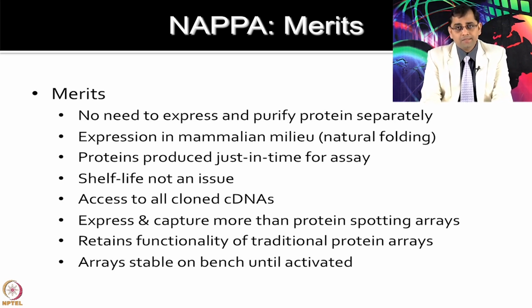Protein production can be just in time for the assays to happen. Since you are producing the protein on the same day when you want to do the experiment, you are storing the chips which only have the DNA, and those are very stable chips, even at room temperature. On the day when you want to do your assay, your experiment for biomarker discovery or protein-protein interaction studies, you are going to express the protein. So, shelf life is not going to be any issue.